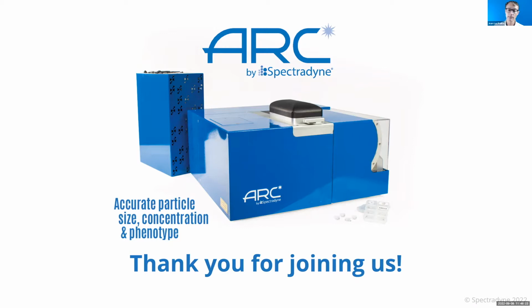Got another one here from Shiva. Hi, Shiva. Apart from getting relative percent of fluorescent EVs, would it be possible to collect the different populations by flow sorting? And the answer is not currently. Right, that's a future technology, flow sorting at the end of this one.